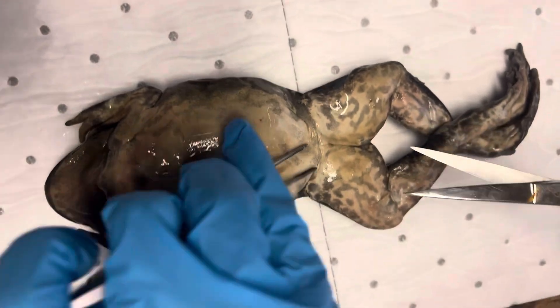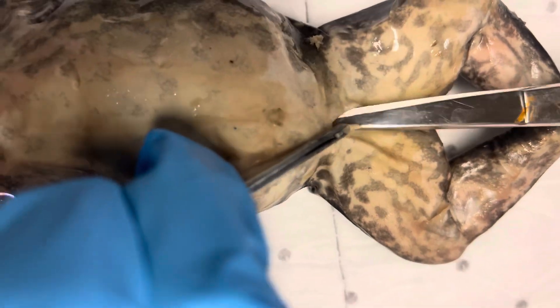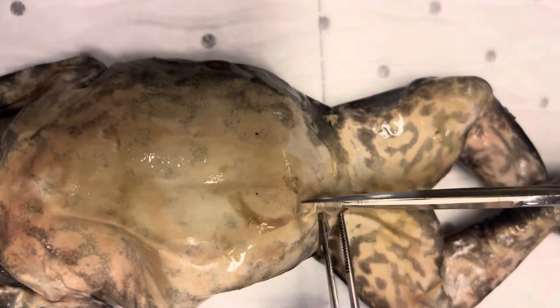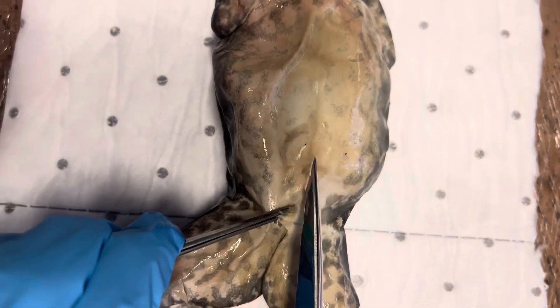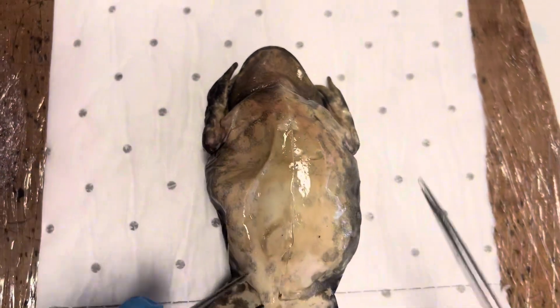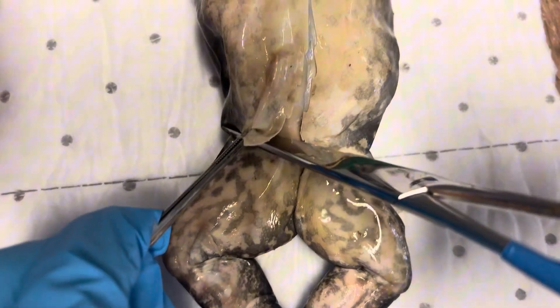How we start off is just with the skin — we just make a small horizontal incision in the skin like so. Once you have that, I'm just going to turn it round. We cut right up the middle, skin only, keeping the scissors as upright as possible, right up to the throat. You can then cut down the sides, top and bottom.